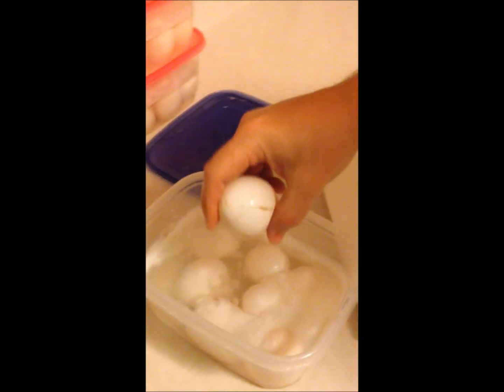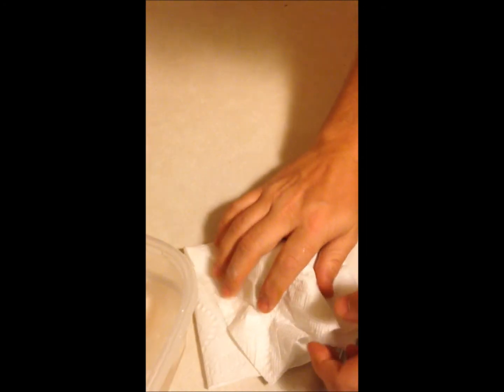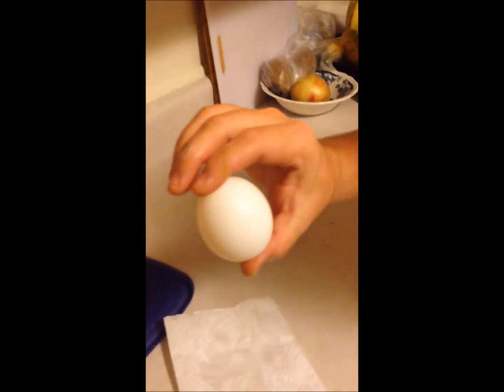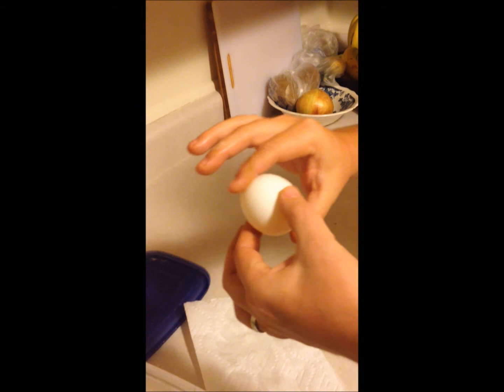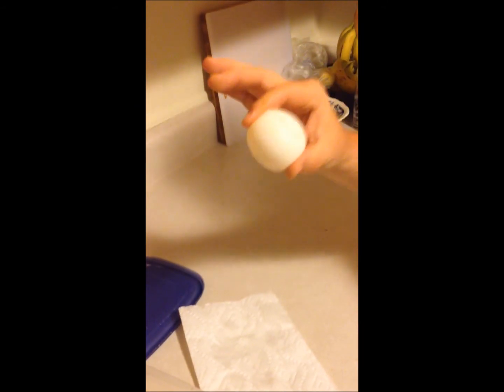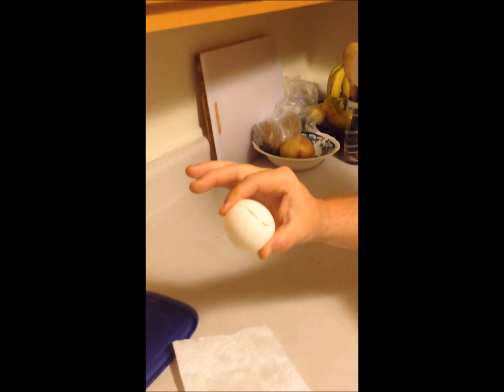I'll wipe it off and get some of this extra vinegar off of it carefully. We don't have a shell anymore, so I'll wipe it off and you can see that it is now squishy. There's no longer a shell on the outside of it, and that's exactly what we need. We got rid of that shell, so now we can use it for our experiment, which we will start once I bring these back to class.